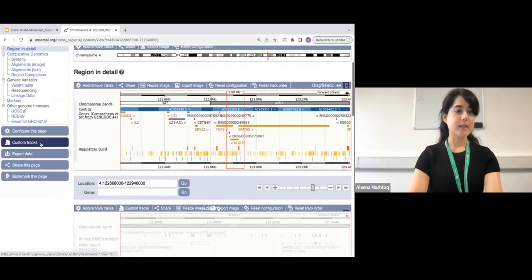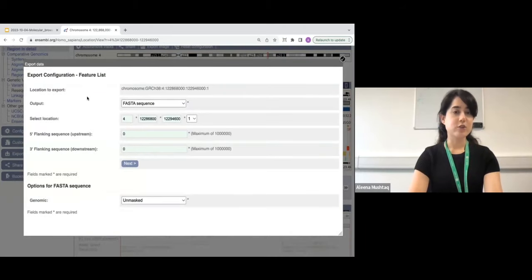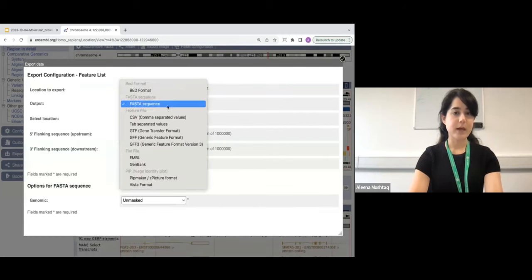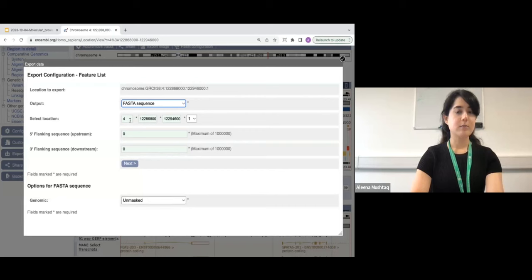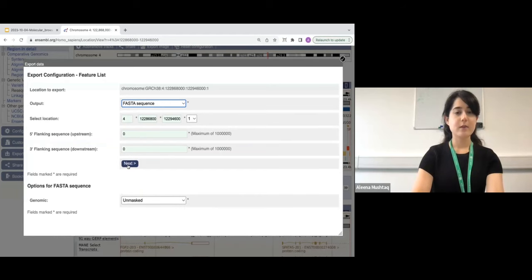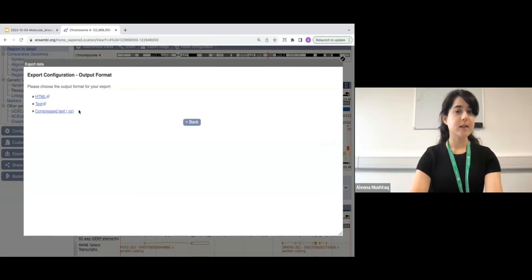You also have the option to add custom tracks — these are publicly available tracks. You can also export data by clicking 'Export Data' on the left-hand side. From there, you can choose the output format: FASTA sequence, BED format, comma-separated, tab-separated, GTF, GFF, and so on. There are also flat file options. You can select the location of interest and choose the flanking sequence at the 5' and 3' ends. Clicking Next, you can choose the output format for your export as HTML, text, or compressed text.